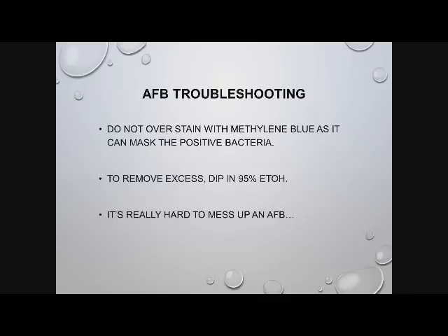So AFB, don't overstain with methylene blue because you can mask the positive bacteria. If you get too much in there, dip it out in 95% alcohol. Some of it will be removed, but if you just flat overdo it, you might as well do the AFB again. But other than that, it's really, really hard to mess up an AFB. Not on leprosy, but on tuberculosis.